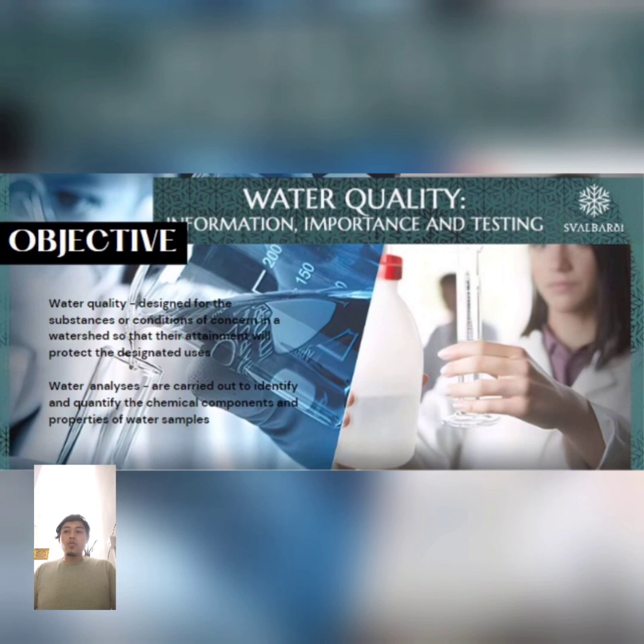And then the water chemistry analysis is carried out to identify and quantify the chemical components and properties of water samples. The type and sensitivity of the analysis depends on the purpose of the analysis and the anticipated use of the water.